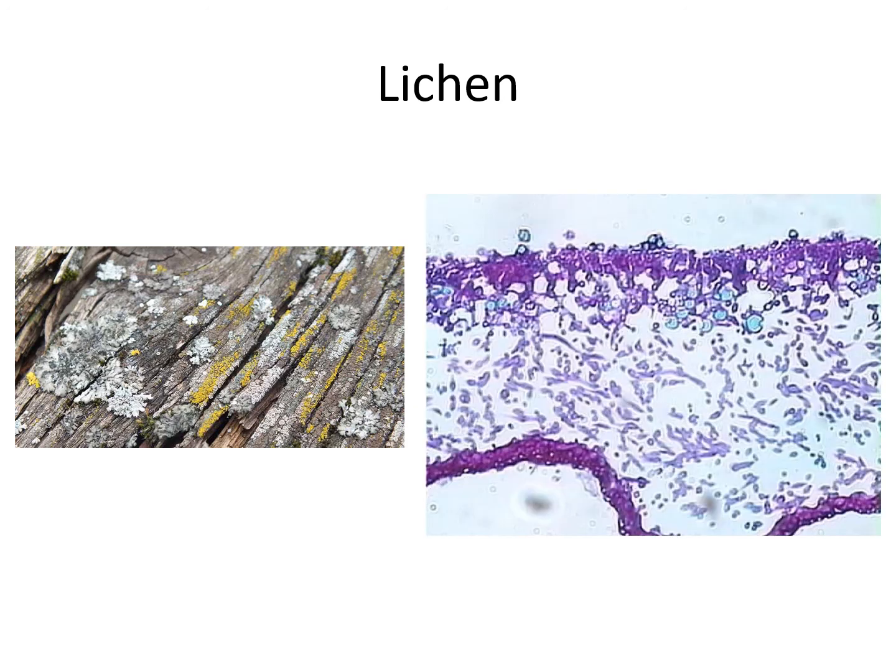You will look at a microscopic view of a lichen, and you should be able to see some of the algal cells. Those are photosynthetic, and they produce glucose by photosynthesis to help provide food and energy for the fungal cells, so for the mold cells. So a lichen looks like it may be damaging the tree, but it's not, because the fungus actually gets energy from the algal cells. So it's a symbiotic relationship.